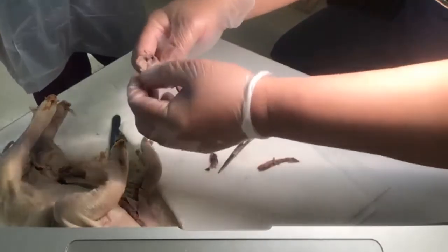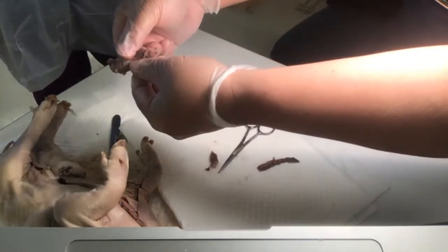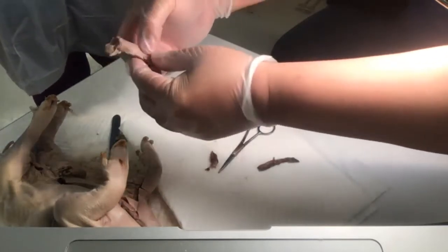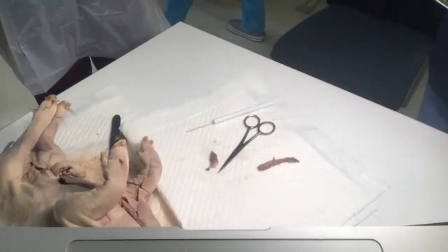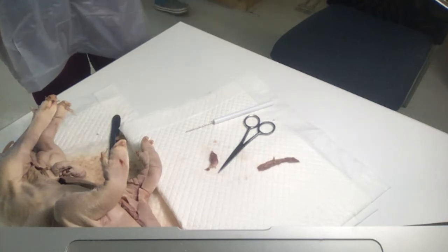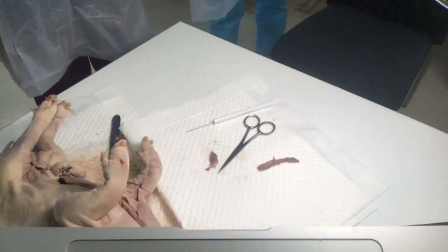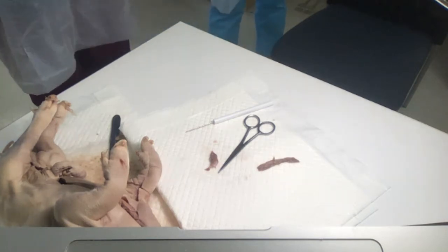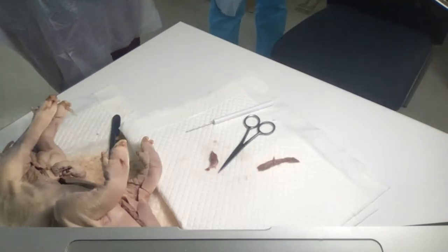So pass this around. Everyone look at all the parts, right? And see if you can identify which one's the esophagus, which one's the trachea. Look on the bottom and you'll see one big open tube and one big flat tube. So that means when you're eating, what happens? The epiglottis folds down. So you shouldn't be breathing when you eat or drink, because that should cover your trachea so that the food or the water goes down the posterior flexible tube called your esophagus, right?